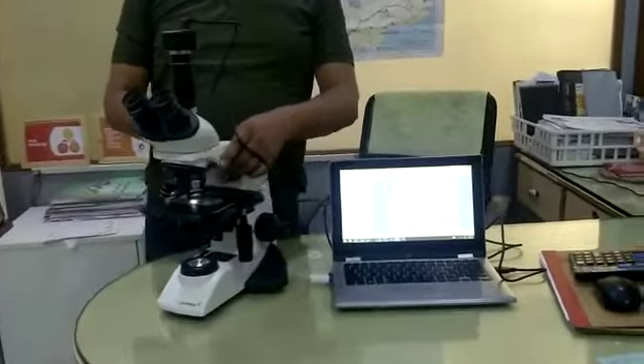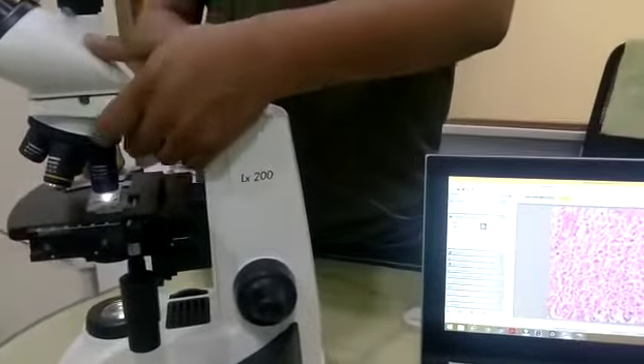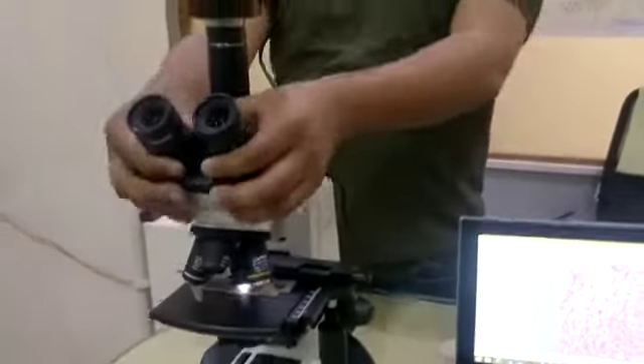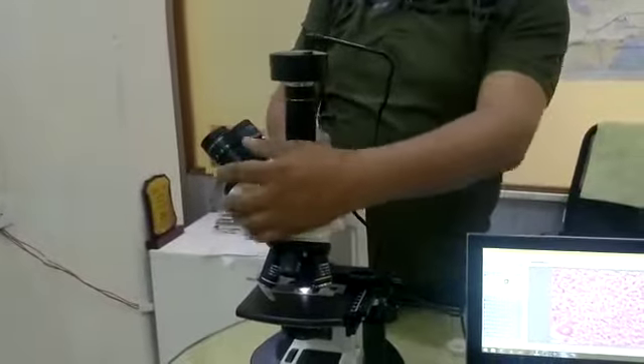This is the LX200 model — a new model of the LX200. The old one is no longer in production; this is the new body that is coming now. It has got a sliding head, rotatable head, and screwless rotation.